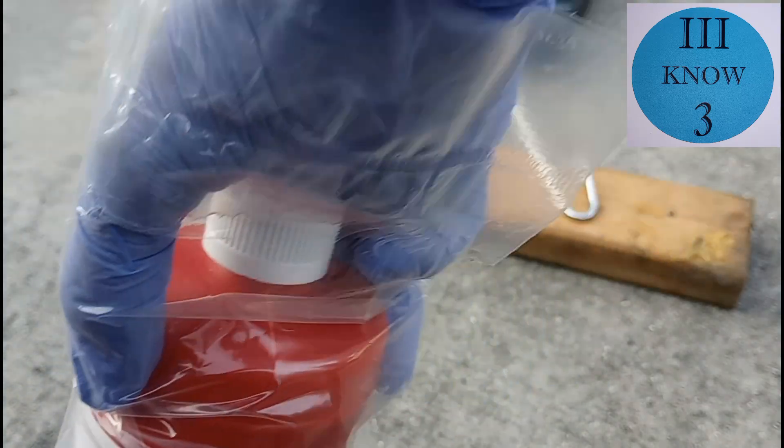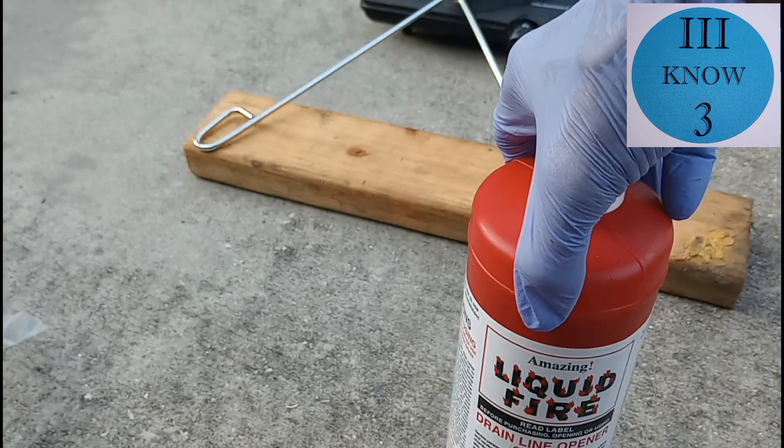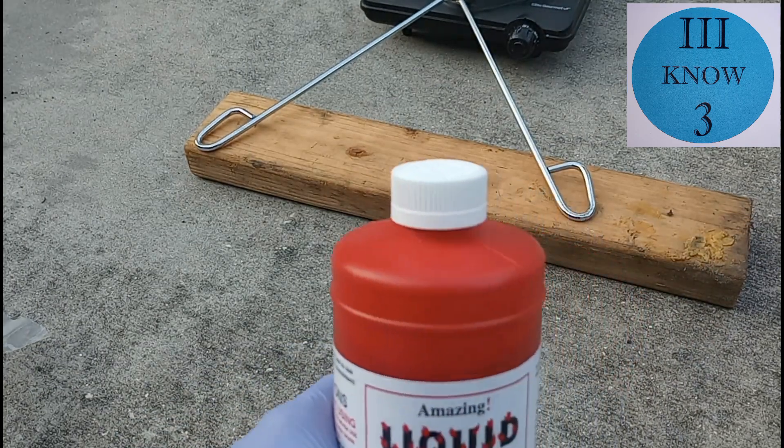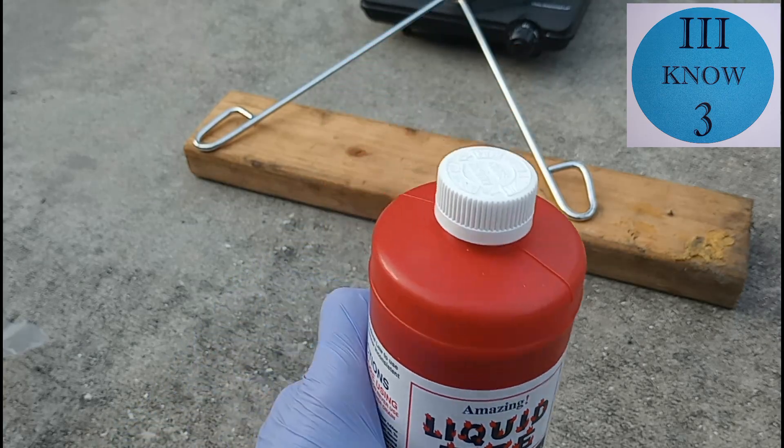I needed some sulfuric acid. I could have ordered some and had it delivered, but right here at Ace Hardware I picked up some Liquid Fire drain line opener.